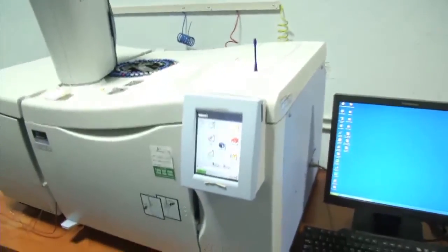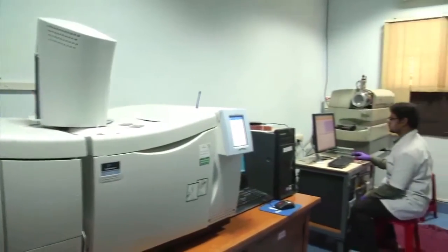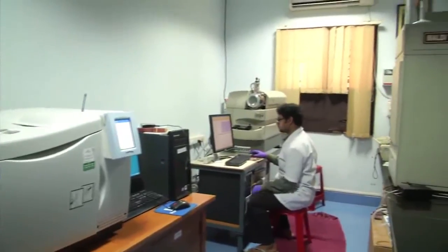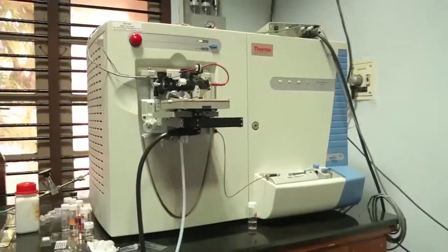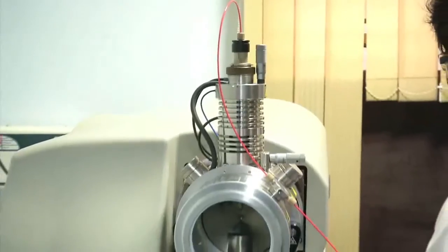Mass spectrometry, especially matrix-assisted laser desorption mass spectrometry and electrospray ionization mass spectrometry, are useful in understanding the composition of the clusters.